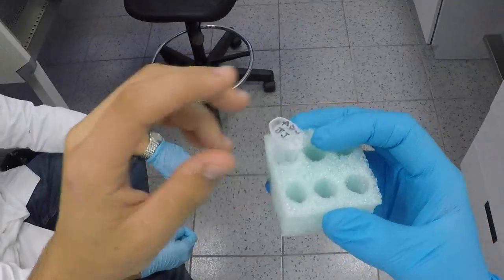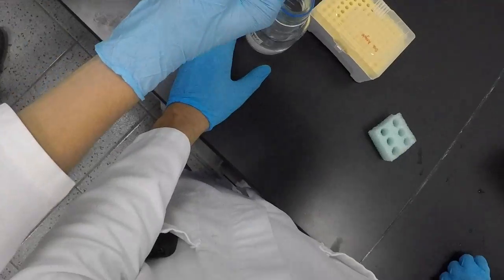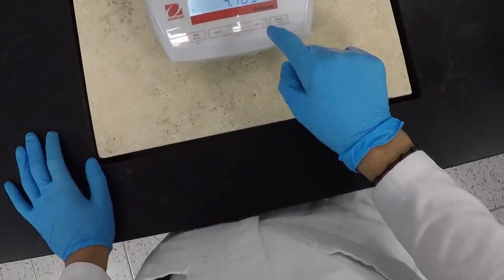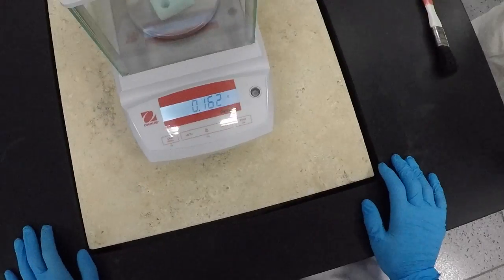Pipette off the supernatant and add 3 volumes of ethanol at 70%. Centrifuge for 3 minutes at 8700 rpm. Pipette off the liquid, being careful not to lose the pellet with your DNA.